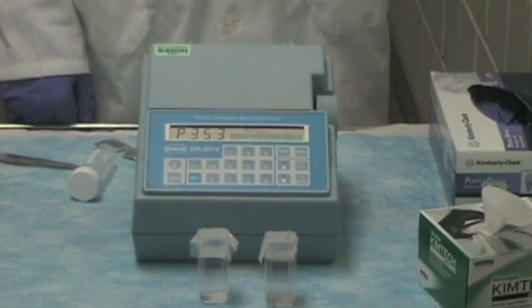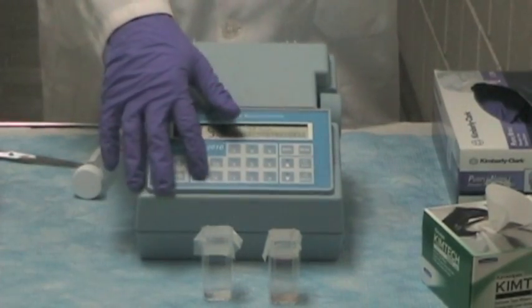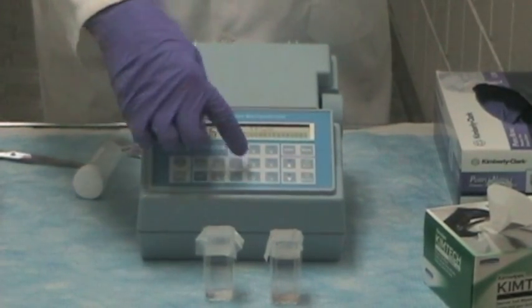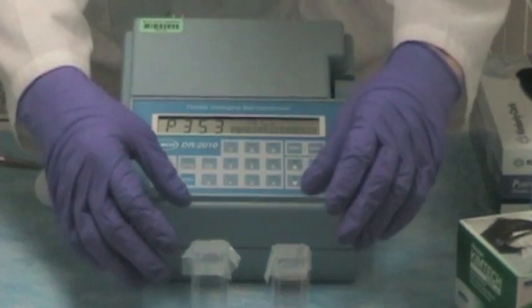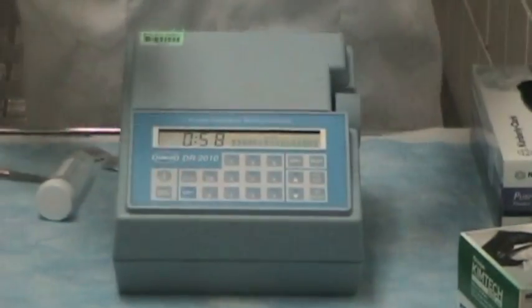The next step in the process, we need to encourage the reaction. We will shake for a minute by pressing Shift-5 or Timer, and a one-minute timer will come up. Then just shake for a minute.